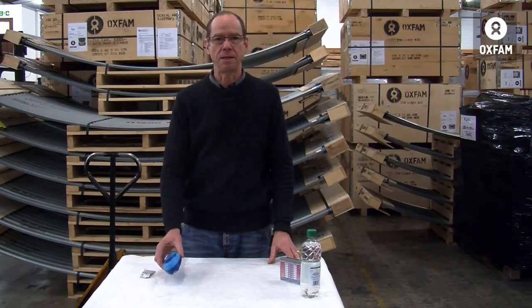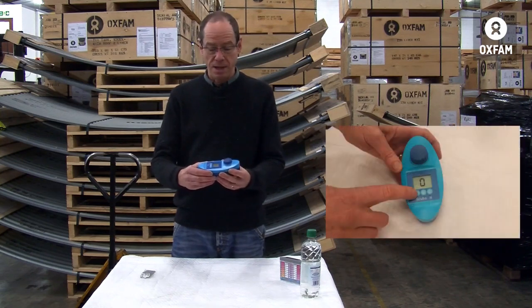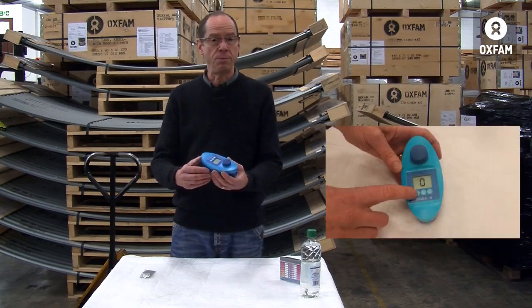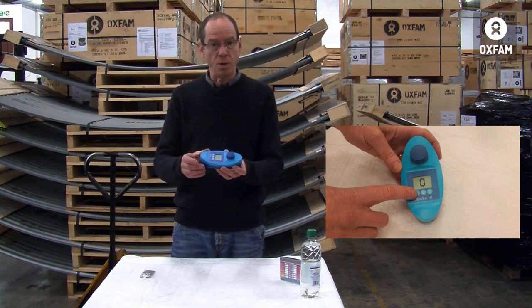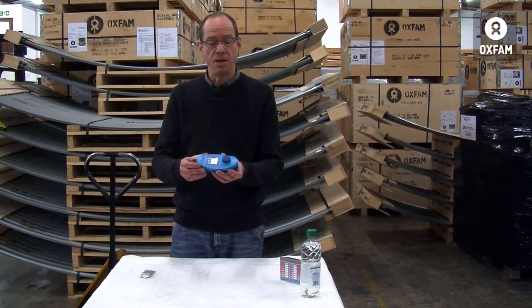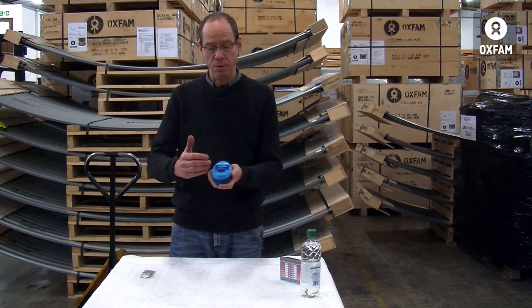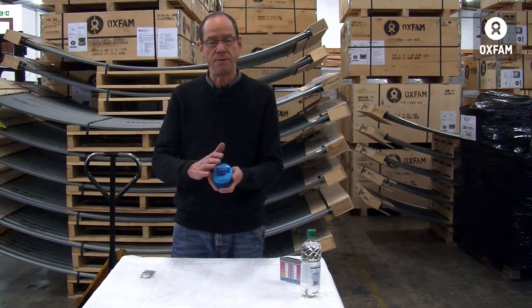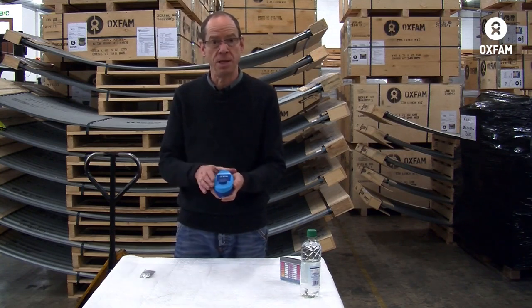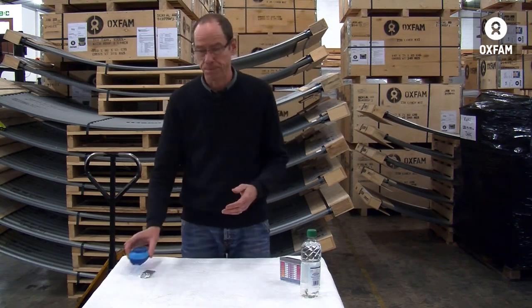The other thing we'll look at is this digital photometer. This is a very simple kit. It'll measure chlorine, it'll measure pH and cyanuric acid. These things come in different versions. This one costs about £160. The huge advantage of this is that it's simple to use and it will give you a consistent and accurate result every time. There's no subjectivity between samples or between people using the kit compared to the Pooltester. So I shall show you now how they both work.